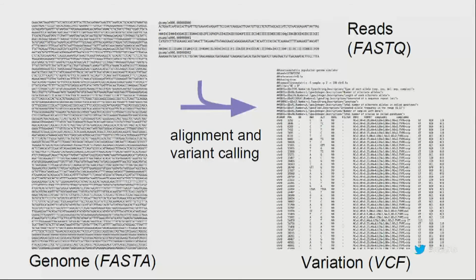And so the standard practice is to take a reference genome, which is just a big string, right? We align new reads to it, and then we can do other stuff. We can do stuff with the read alignments. We could call variants and get genotypes from them. We might be interested in coverage or allele-specific expression analysis.